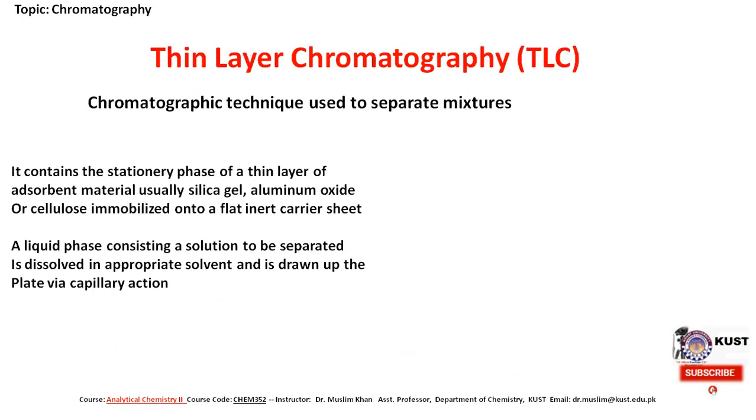So the next is thin layer chromatography. Thin layer chromatography is also a chromatographic technique, a type of planar chromatography. This is routinely used by researchers in the field of phytochemistry and biochemistry, mostly for identification purposes, because this is a semi-quantitative technique.